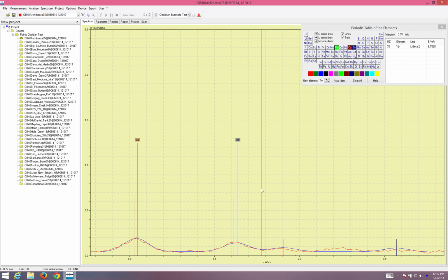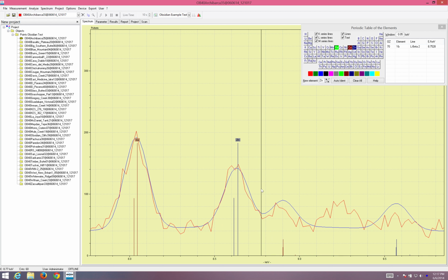If I look very closely, and here I navigate up, I see there's a very small peak over here that is not captured by the Bayesian deconvolution. I click there, and I see that it is gallium. Now, without a Bayesian deconvolution, it's very hard to notice this small peak. But when I draw the Bayesian deconvolution, I can see that there's clearly a peak above my background area. What I find that Bayesian deconvolution is very good at is finding invisible gorilla elements.